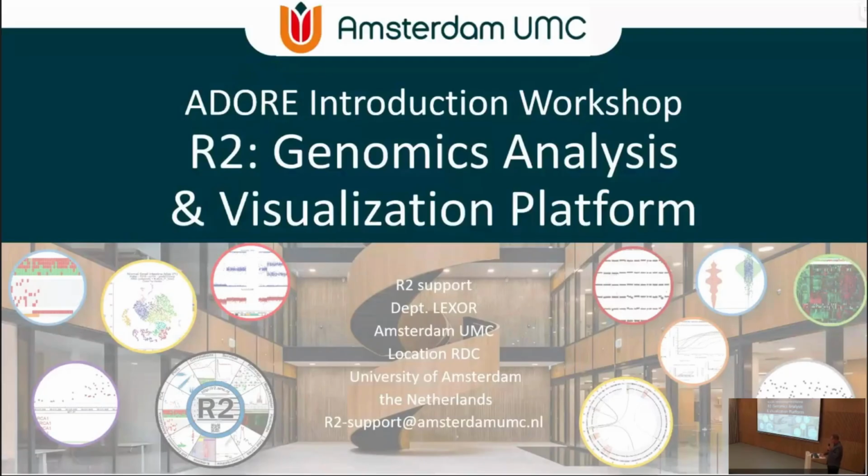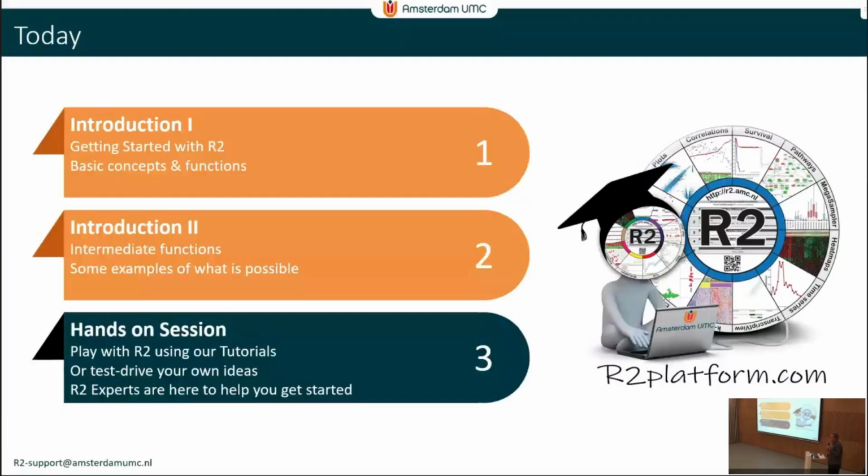And today I'm going to show you a little bit how this program works, what's the concept behind it, and with a number of demonstration slides I will show you how you can use it, how you can test hypotheses and these kinds of things. Hoping that this will be helpful for you as well, and that you get the vibe of it and want to use it for your own work.